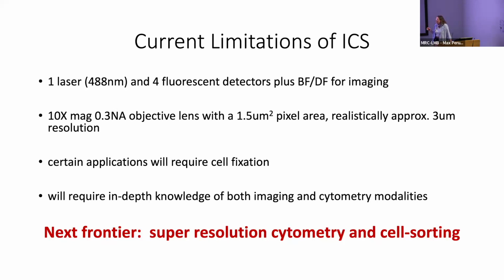changes. The next frontier really is super resolution cytometry and cell sorting. This is absolutely going to happen, I believe, in my lifetime. The cell sorting part will be far more challenging, but I think we will most certainly see super resolution analysis cytometry happening within the next, I would gather, 5 to 10 years.